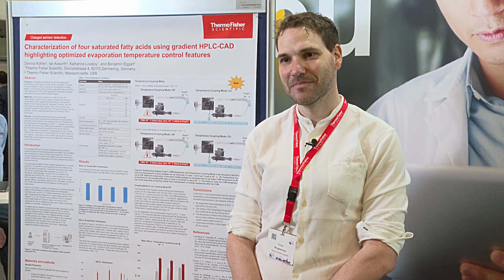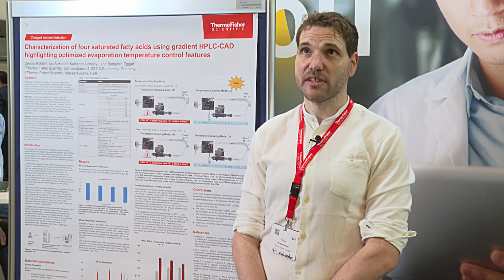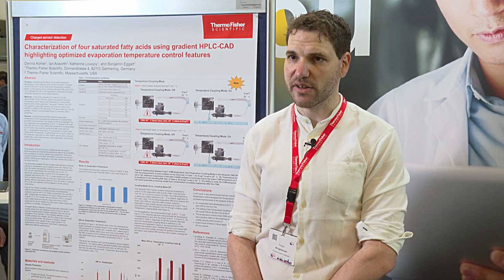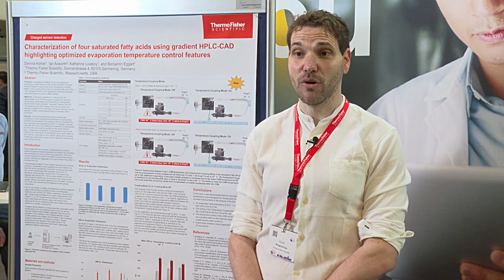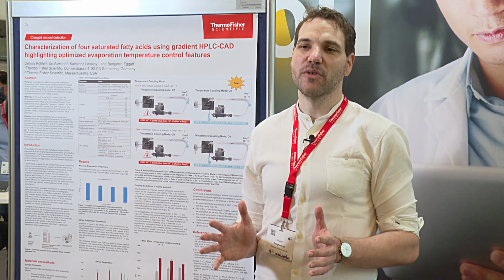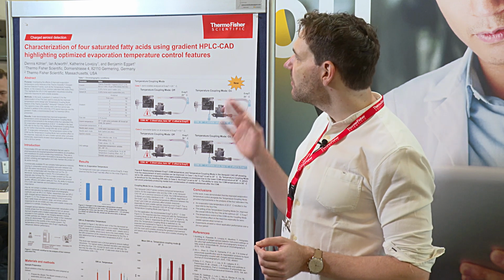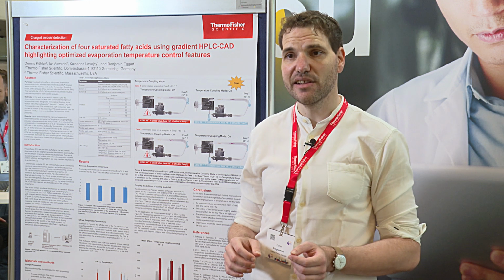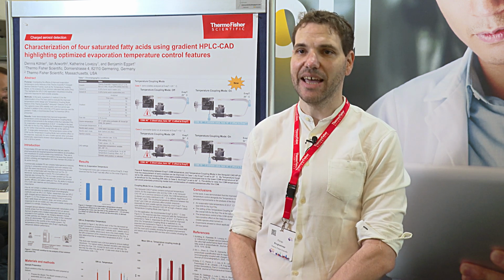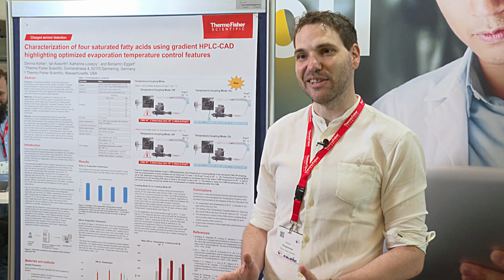And was there anything in your research that surprised you or stood out as a key insight? I mean, CAD detectors are universal detectors, and that's a big plus. But it's also quite tedious, right? Because if it's a universal detector, you have so many applications to choose from. So what we did is we focused on saturated fatty acids, tinkered around with our new temperature coupling mode, and wanted to see if there is improvement. And then, of course, we could showcase that there is improvement.